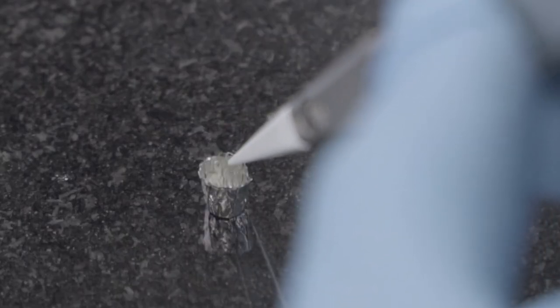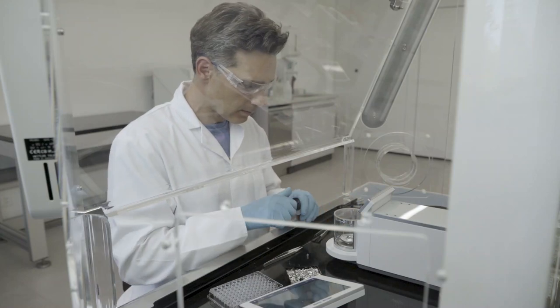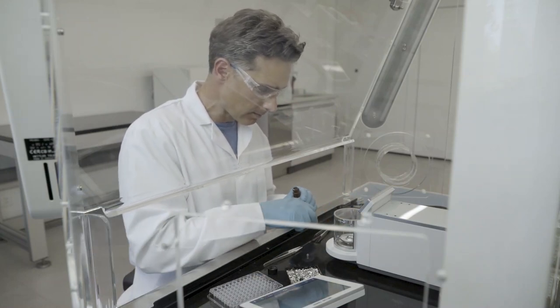The precise handling that is required makes preparing samples for elemental analysis a time and labour intensive process.